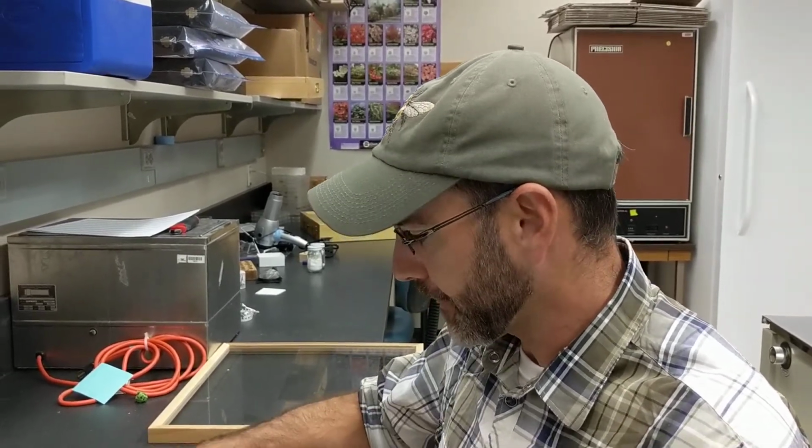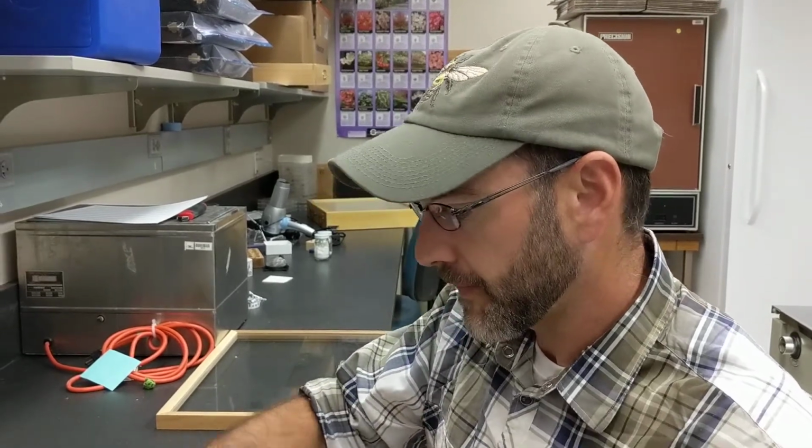So what if you didn't take the bee course, and so some of this is really challenging? You don't know the genera that well. Can you still do this kind of sorting? Sure, and again, it's a learning process. So what you're doing is just using the powers of observation to try and recognize what the differences are. Does it look like a bee? Is it hairy? Does it look like a wasp?